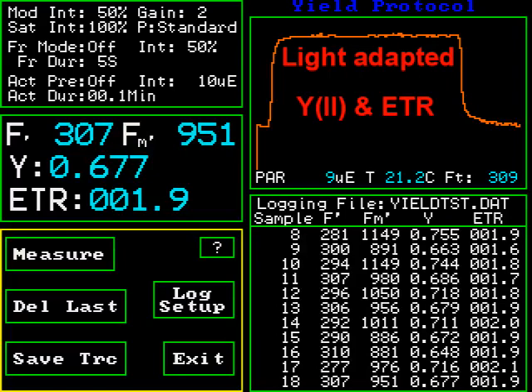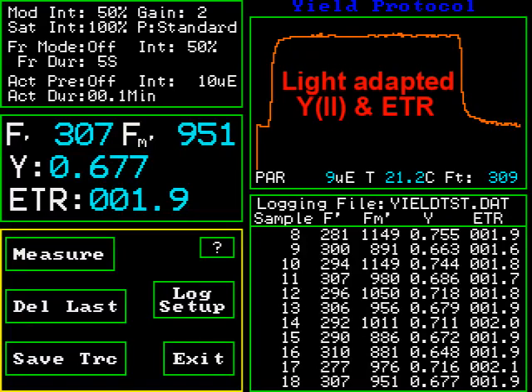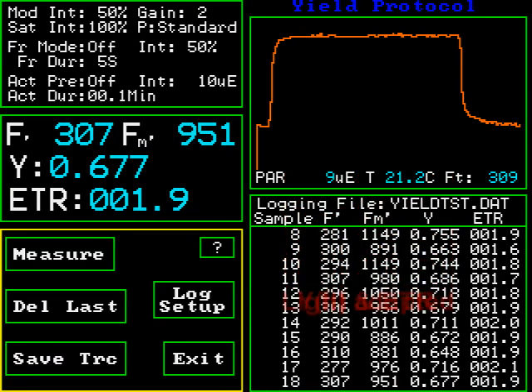Quantum yield of PS2 is a light-adapted protocol made possible by modulated light. This test was developed in the 1989–1990 timeframe by Bernard Genty. It allows the measurement of quantum yield of PS2 while the leaf is undergoing photosynthesis. Relative electron transport rate is also provided. Current and previous results can be viewed from the measuring screen along with measuring traces. Since quantum yield of PS2 varies not only with plant stress, but also with light irradiation level and leaf temperature, it is important to record this information with every measurement for valid comparison.